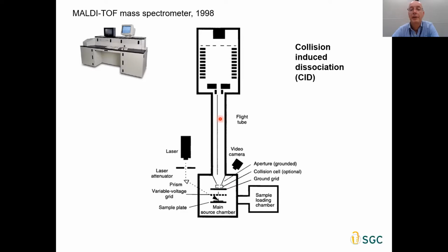As they do that, all the ions have the same charge. They can either be all positively charged, or you can reverse the polarity, they can all be negatively charged, but they will tend to want to repel each other. There is Coulomb repulsion between these ion species, and to counteract that repulsion, the function of this beam guide wire is to pull the ions closer into the center of the tube.